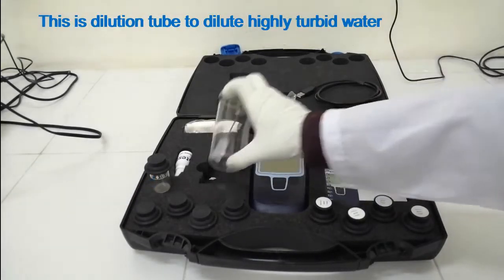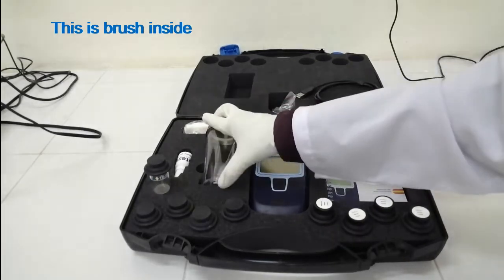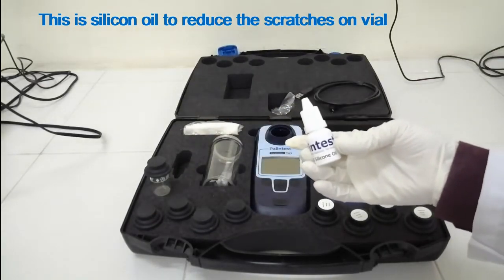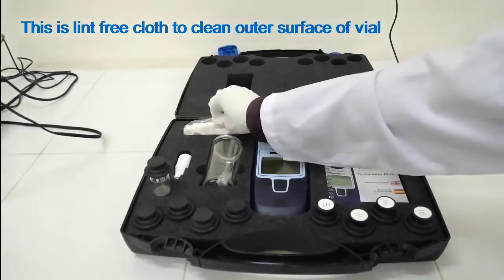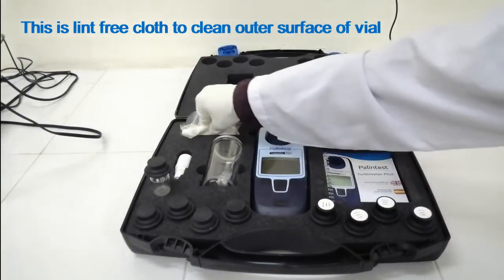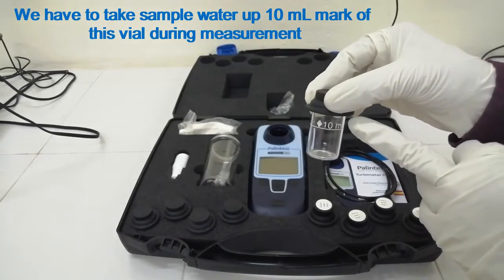This is the dilution tube to dilute highly turbid water. This is a brush inside. This is the silicone well to reduce scratches on the vial. This is the lint-free cloth to clean the outer surface of the vial. We have to take sample water up to the 10 ml mark of this vial during measurement.